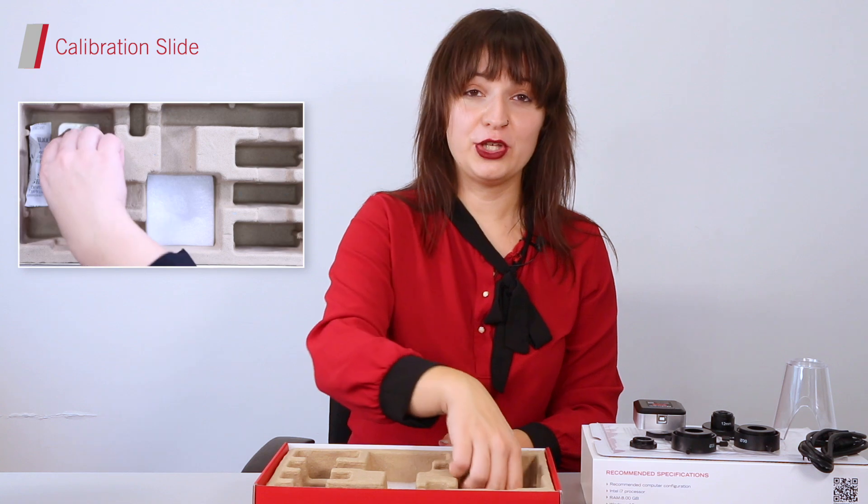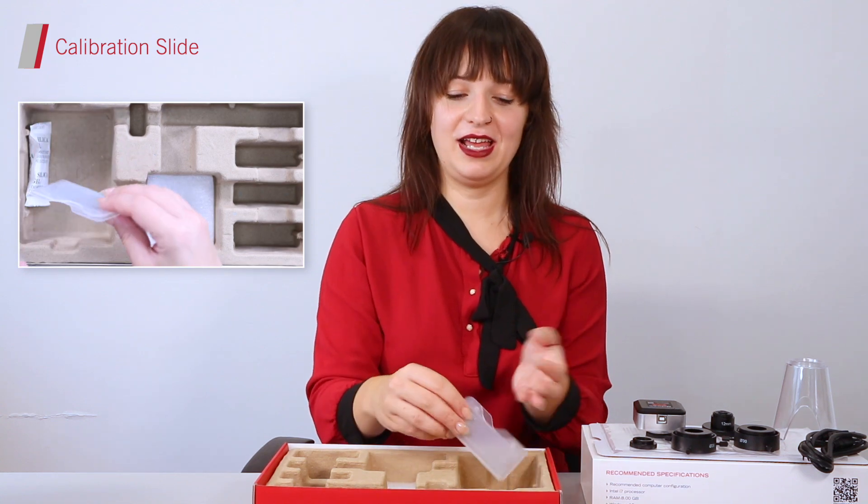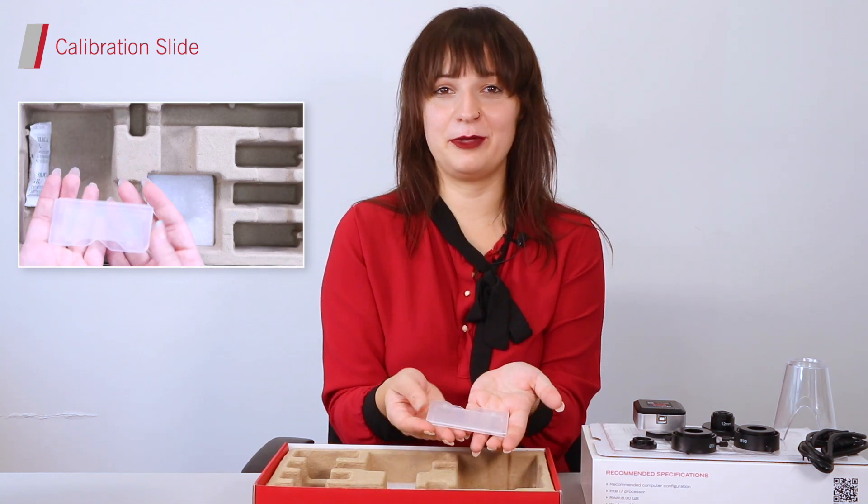And lastly, to use your camera with your microscope, you will need to calibrate it. To do that, you will simply use your calibration slide provided. As you can see inside your Moticam A box, you can find all the tools you need to start working straight away.